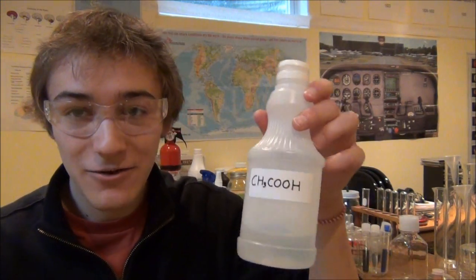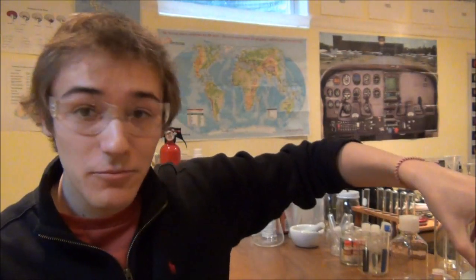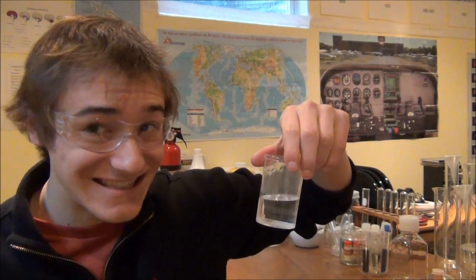So two different, really pretty simple reactions — one of which introduces carbon dioxide into a solution to produce a precipitate of calcium carbonate, and then an acid-base reaction where I add acetic acid, which reacts with the calcium carbonate and removes the carbon dioxide from the solution, restoring the clarity of the original solution. Gotta love chemistry.